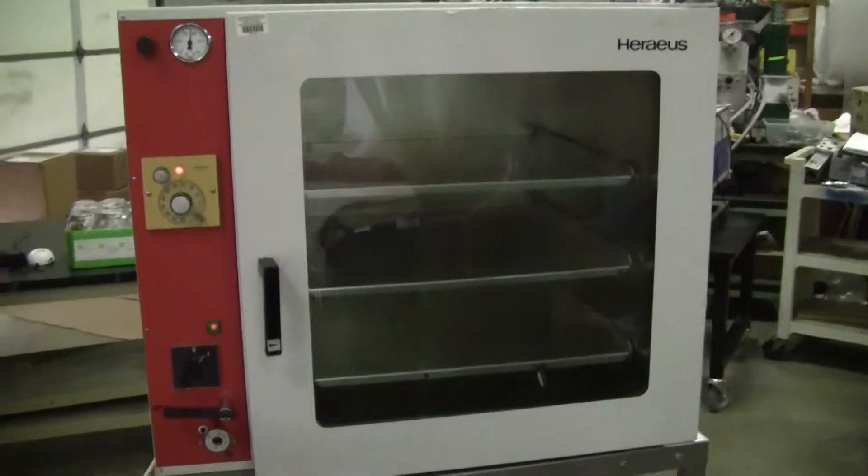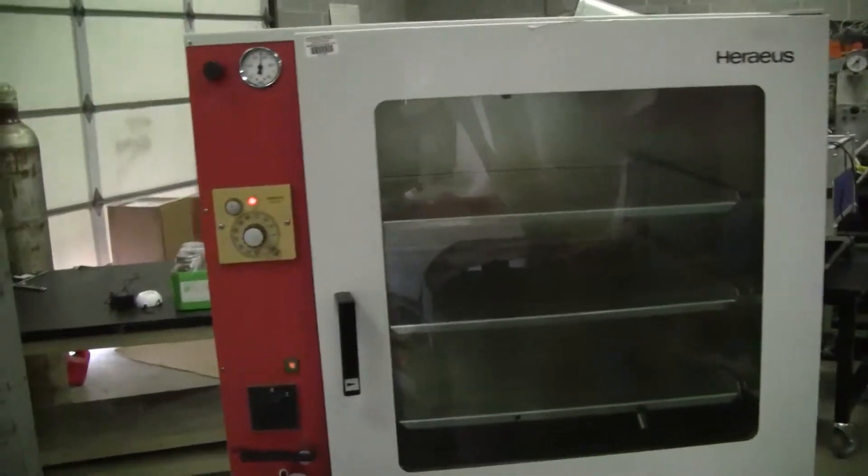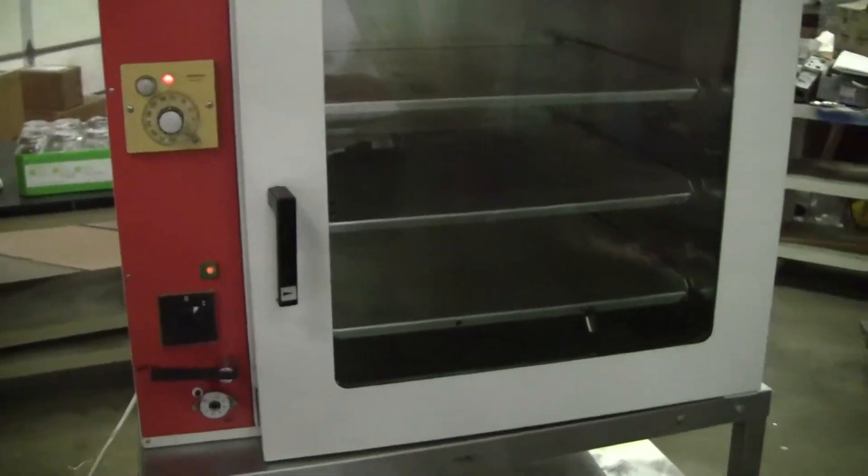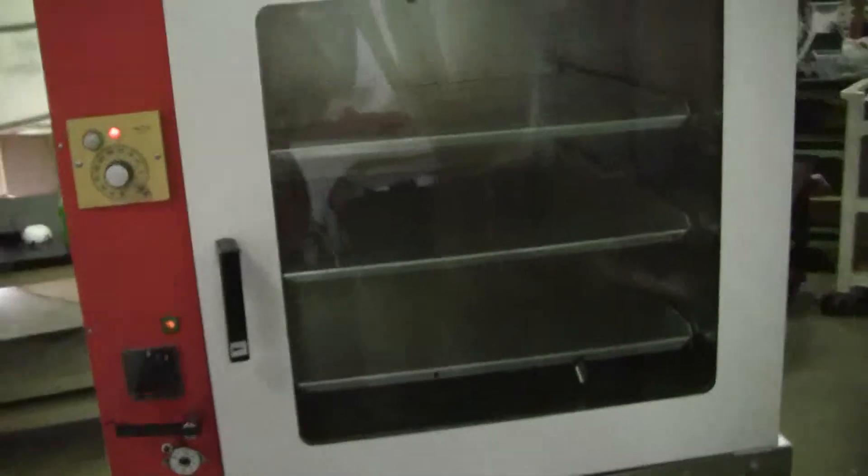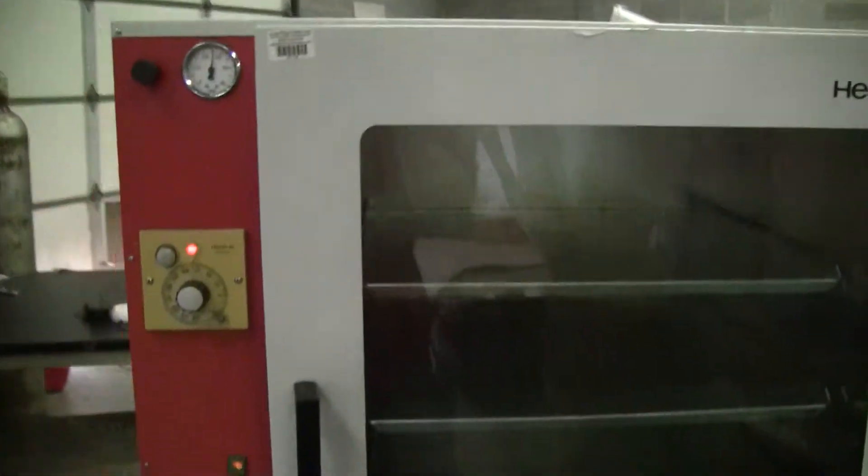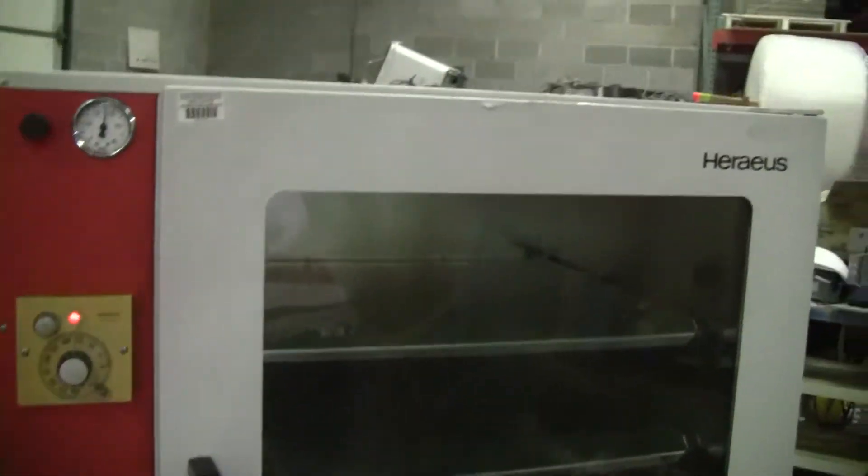Hi, this is Michael from Hitech Trader. Today we're looking at a Heraeus vacuum oven. It's a rather large-sized vacuum oven. Let's start.